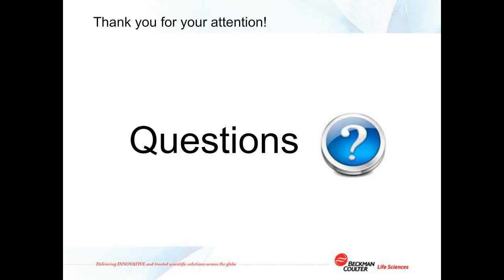There are multiple configurations available. Any recommendations on choosing a starter configuration that can be upgraded in the future? Right, so this is an interesting question. You have to decide in the beginning which are the fluorochromes you're going to use. If your work is going to focus more on using fluorescent proteins, then you should choose a CytoFLEX S system with the yellow laser. If you're going to work with DNA staining, stem cell side populations, then you would go for the near UV laser.